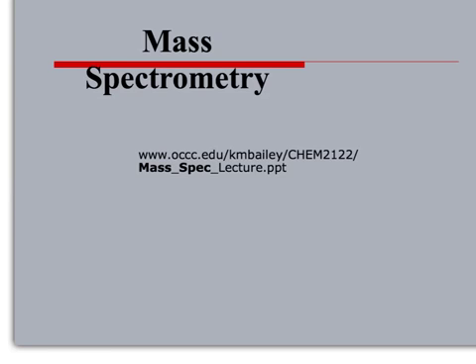Hello everyone. This lecture is on mass spectrometry. Mass spectrometry is a detection technique for various molecules, and it is part of many equipments where the molecules are separated, and whether they are unknown or known, it is used to identify their quantity, as well as, if they are unknown, to know which molecule is present in the mixture.